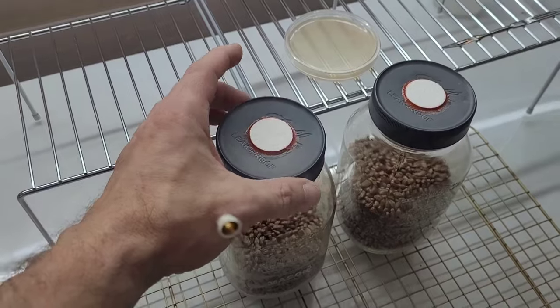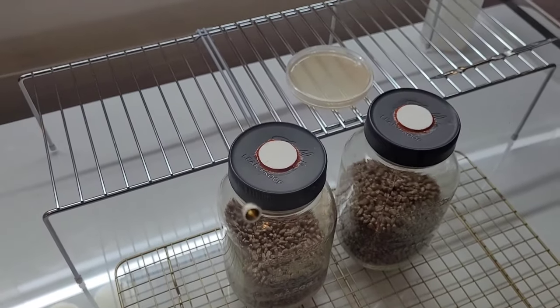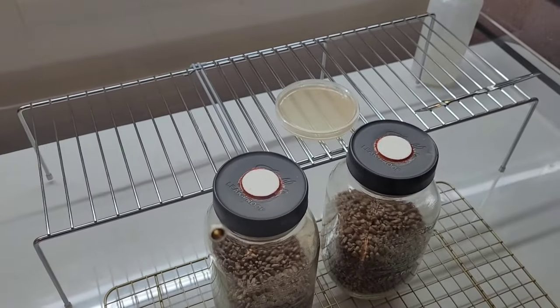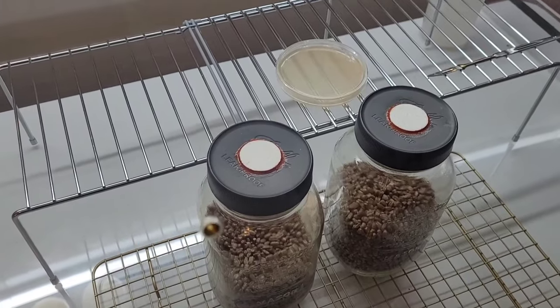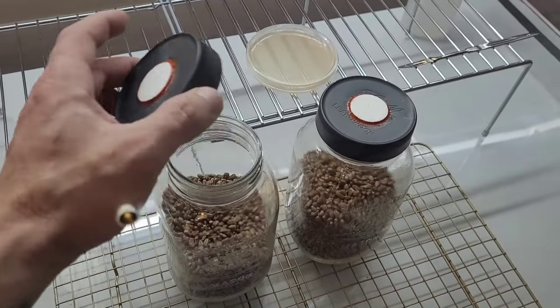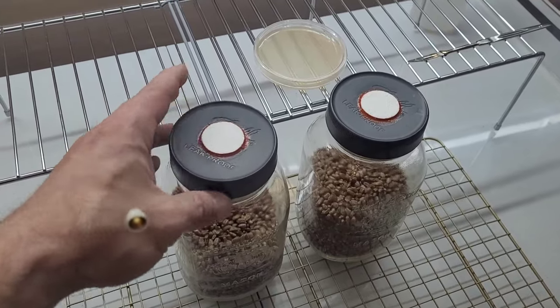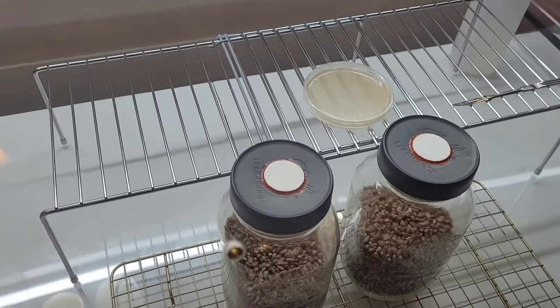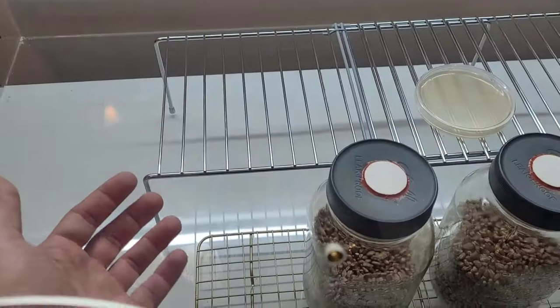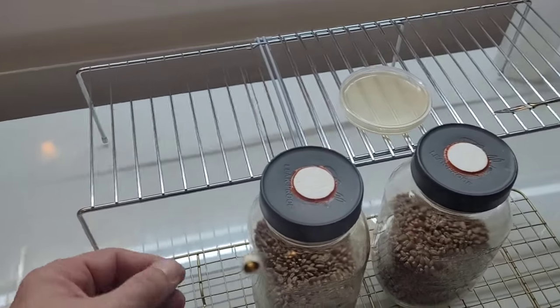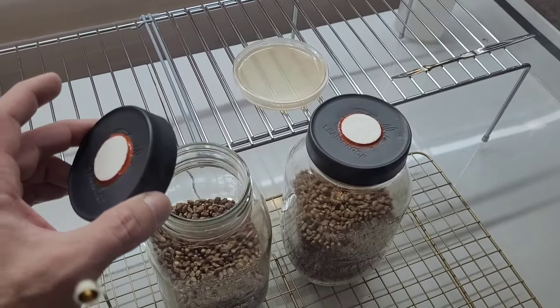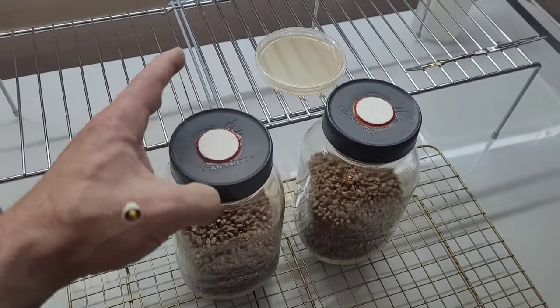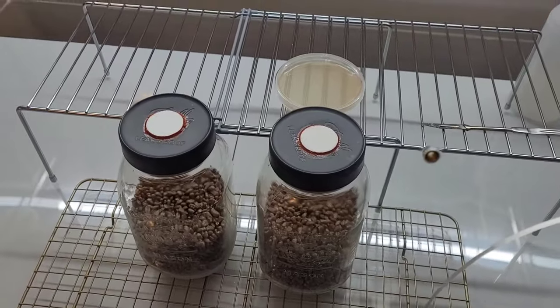And as the name implies, still air is the name of the game obviously. There's no way you're going to be able to maintain perfect stillness, but the more still you can make the inside of your box, the higher the likelihood that you will be able to maintain a sterile environment within your sterile vessels. Now the more turbulence experienced within your still air box, the greater the likelihood that you will have contaminant particles floating around on turbulent eddies being drafted into your sterile work. Now that's obviously not good and can result in mold.